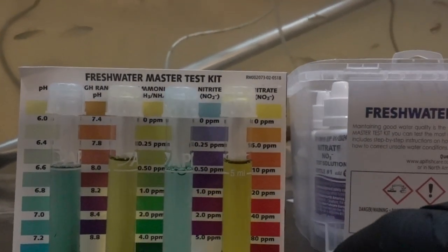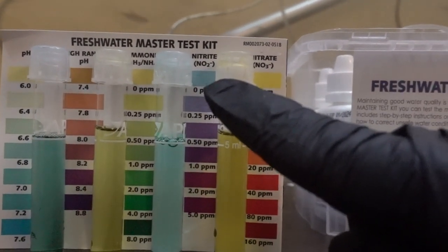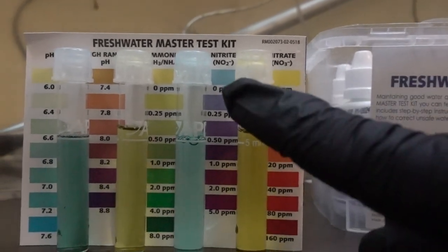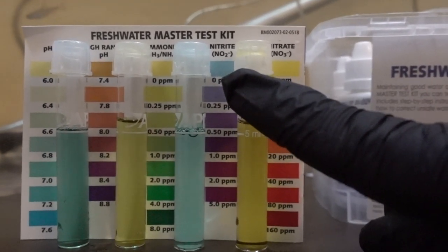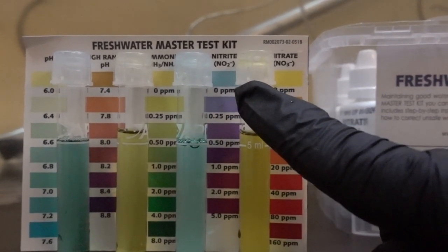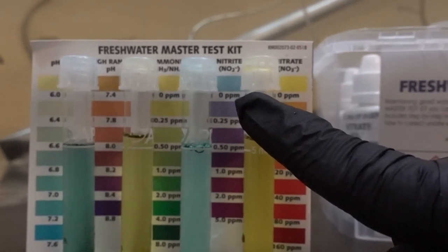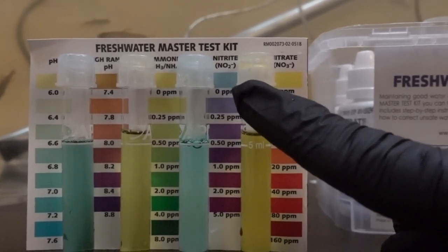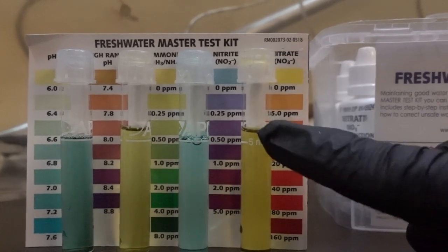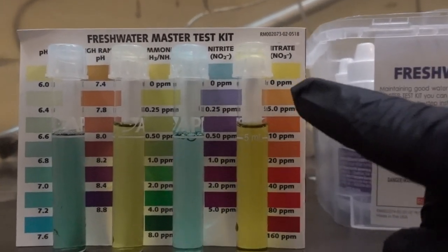That ammonia is then broken down by nitrifying bacteria in the tank — and that's a good thing. Those bacteria break the ammonia down into something called nitrite. Nitrite can also be dangerous for fish, so we want to keep that level low. As you can see, that blue color is really close to zero ppm — zero parts per million — so that's right where we want it. That's great.